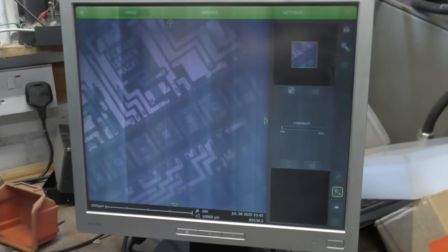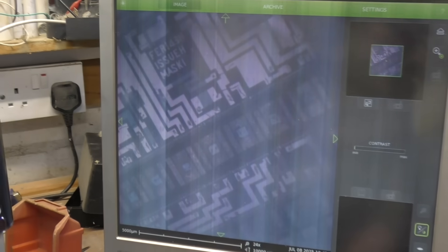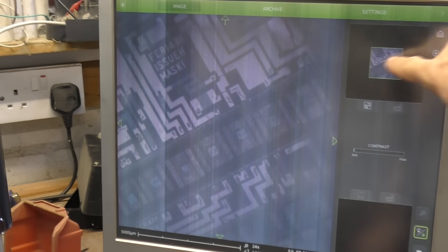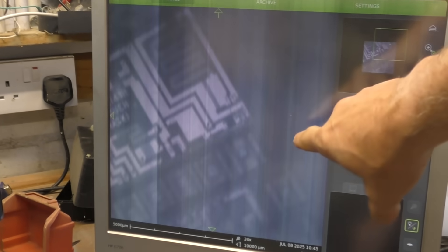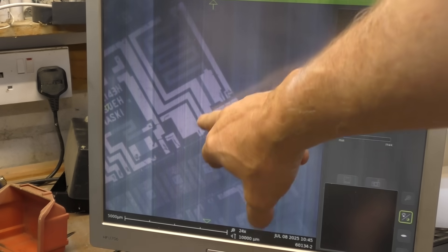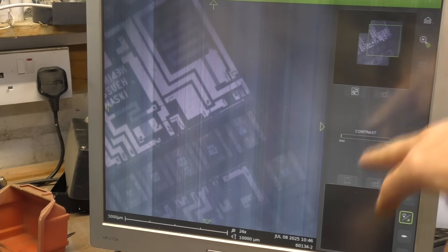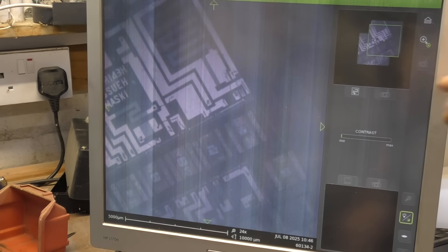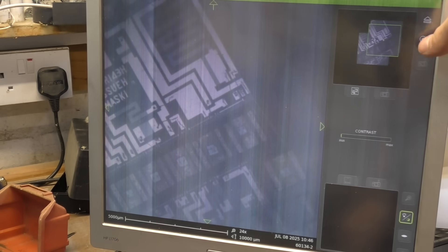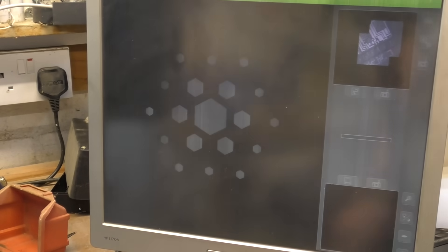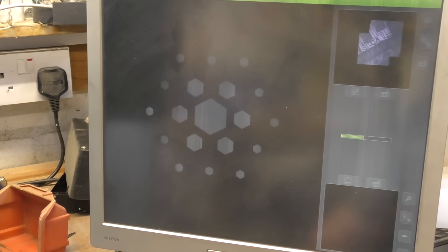Here's our preview image from the camera which we can navigate around on the touch screen to find the bit we want to look at. Now we can go into electron mode, which winds the sample back into the main column.